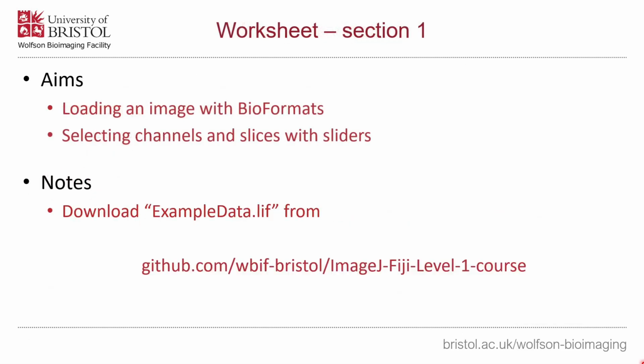Okay, so now it's your turn to do something. We're going to work through Worksheet Section 1. This one's just a nice easy intro. All we're doing is loading up Fiji, dragging in an image to have it import with Bio-Formats, and then mucking around with the channels and slices sliders just so we can be confident that we can navigate around the image.